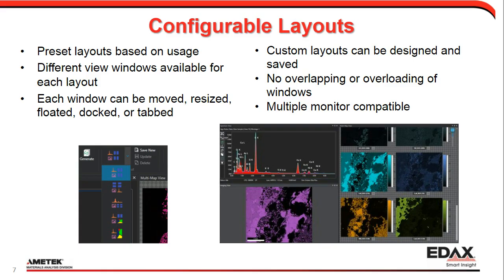The picture on the right shows the currently selected layout, which is multi-map view on the right half, spectrum window top left, and image view window bottom left. All windows are detachable. They can be moved around, resized, floated, docked, tabbed, or moved to a secondary monitor. Custom layouts can be designed and saved. There is no overlapping or overloading of windows.